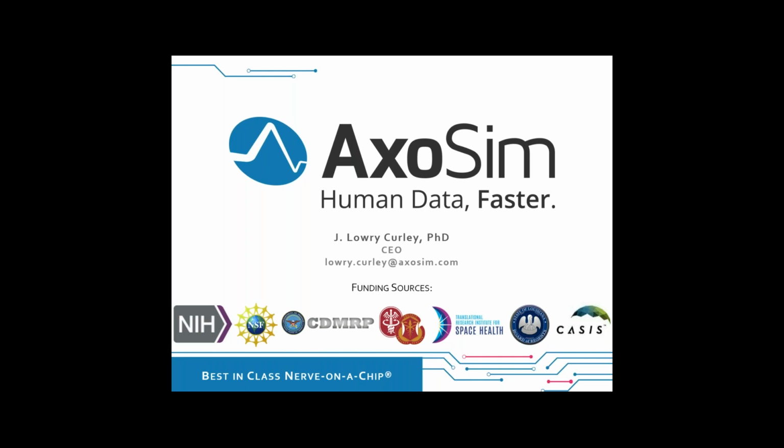And we will do 2 of those samples in, let's say, week 1. We'll do 2 more samples in week 2 and 2 more samples in week 3. And when we've looked at the difference between 6 in 1 week versus spreading it out, we actually see that the reproducibility is a lot better, because it does account for that, within each drug versus testing a drug from one N of 6 to another N of 6 a few weeks later.